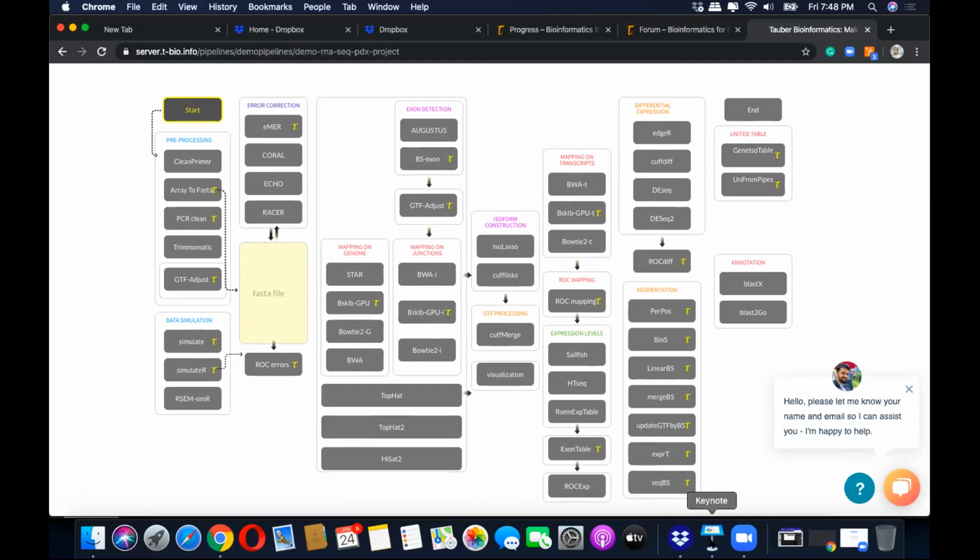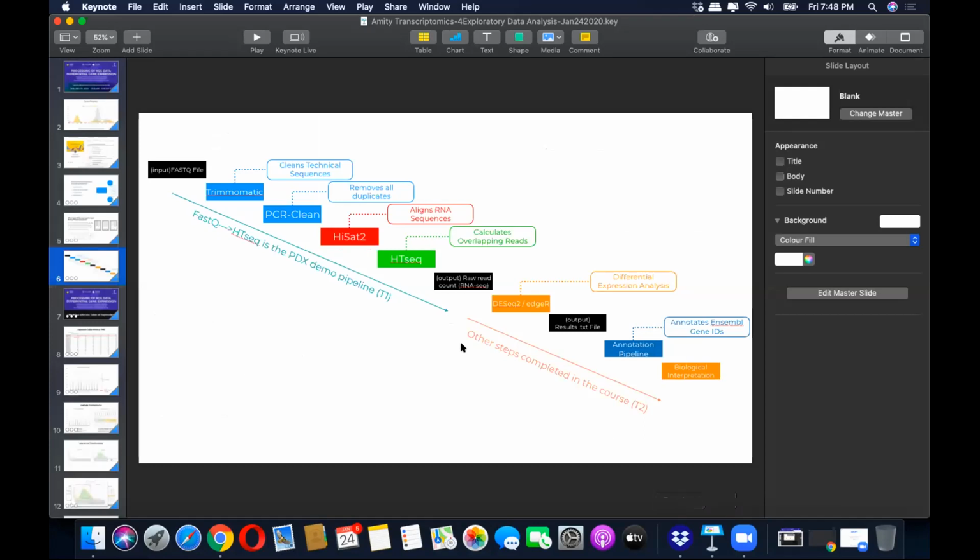So coming back to the presentation, yes, we did this together. We saw some of the algorithms, and we'll be looking into them more and more as we move into this whole journey. Our first step was to clean up those reads, then organize the reads and place them, like mapping. After that, we get a table of expression.